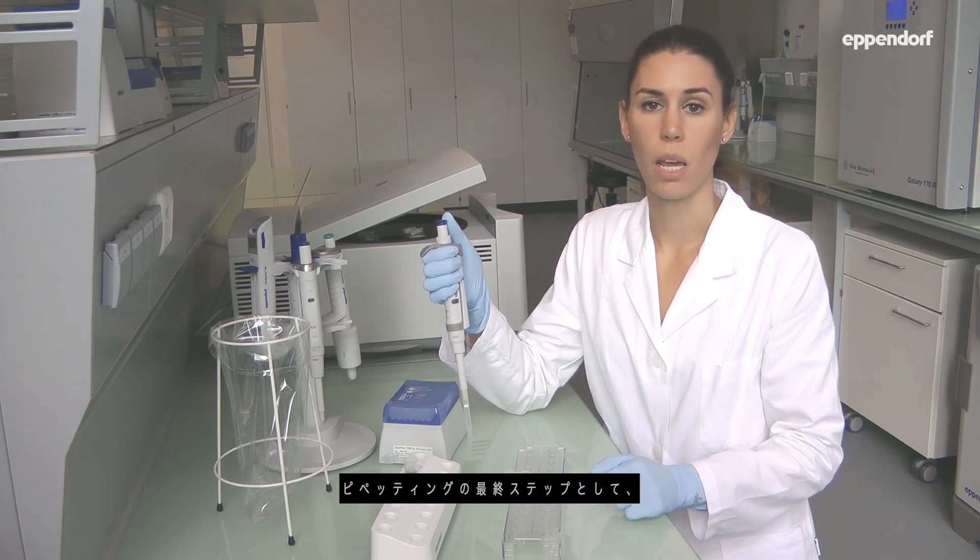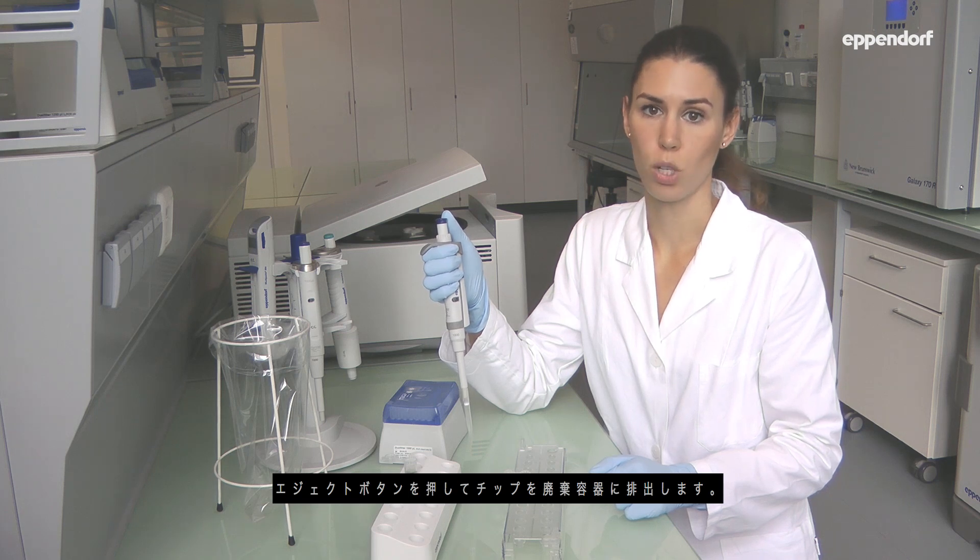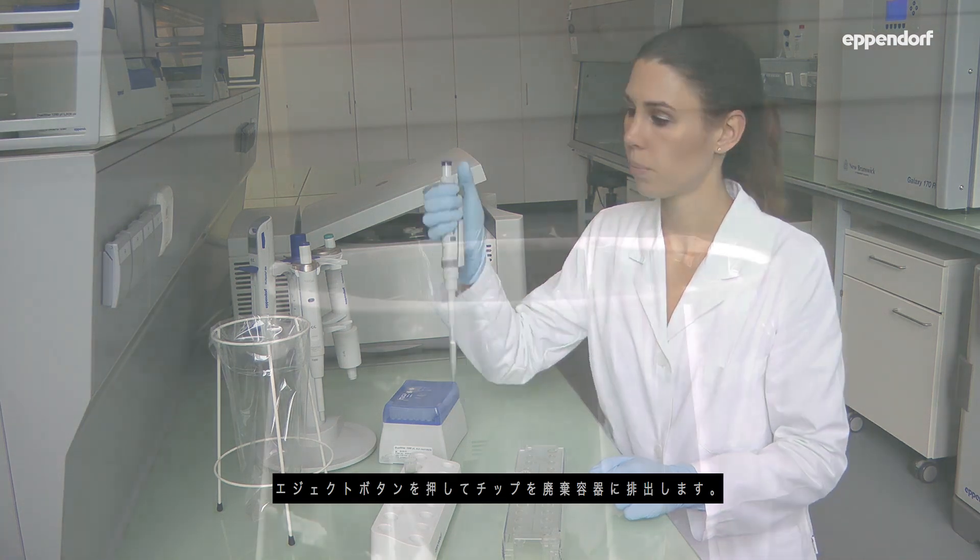The last step during pipetting is ejection of the tip into a garbage bin by pressing the ejector button.